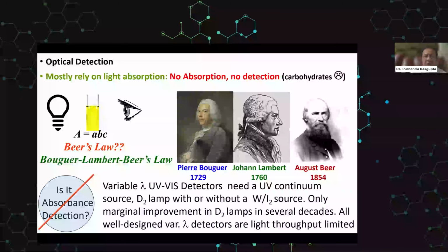The one thing in a perfectly designed detector that you cannot overcome ultimately: you fix your thermal noise, Johnson noise, flow noise, you still have counting statistics, which is called shot noise. That means the uncertainty in the number of photon counts will always vary as the square root of the photon counts.